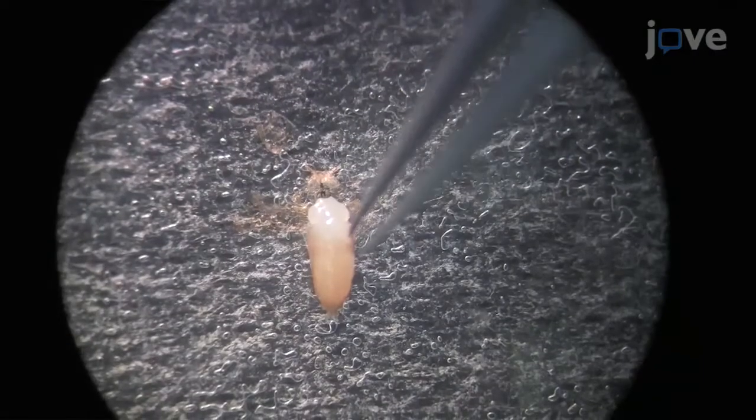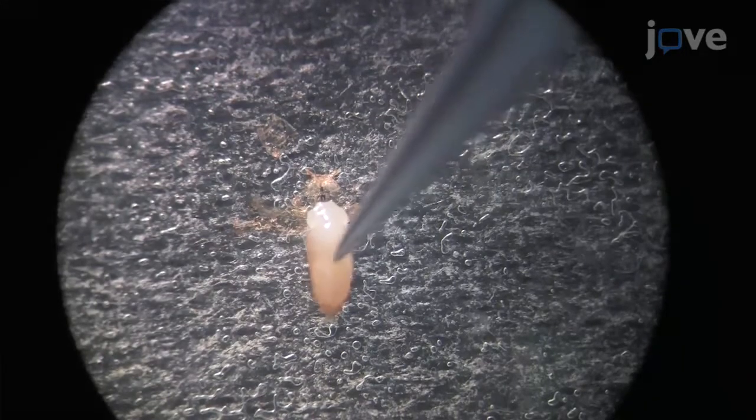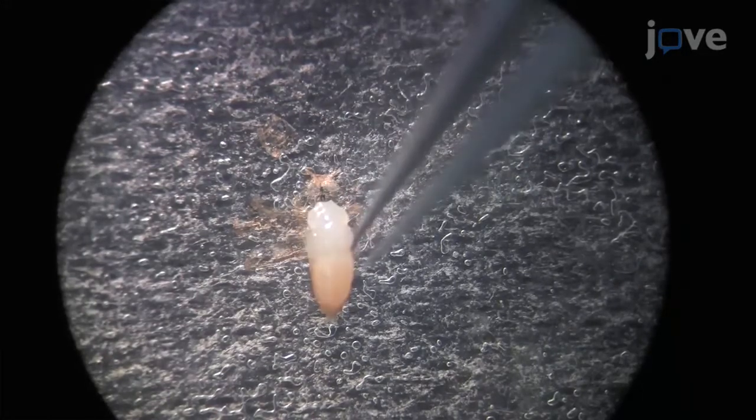The described protocol is designed to image and analyze cell behaviors at global and local levels in the Drosophila pupal epidermis. This methodology could provide insights into different areas of research, cell biology, morphogenesis, and planar polarity, and can be applied to the analysis of other tissues, structures, and models.